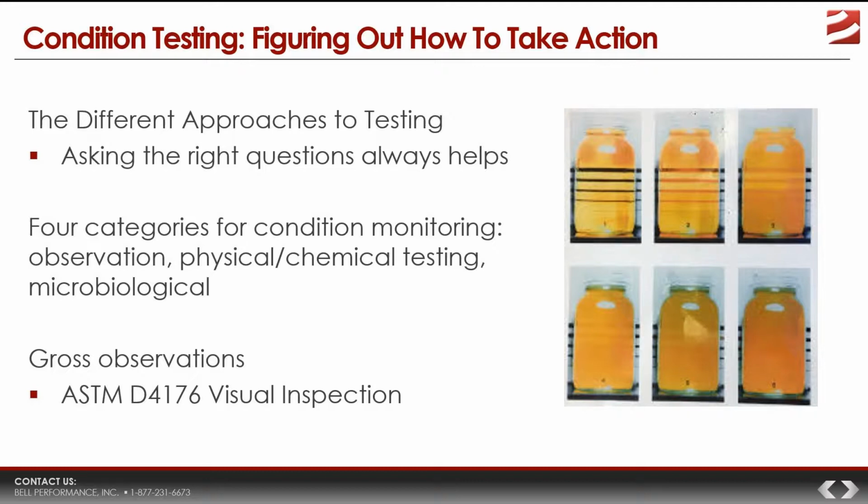Now, when you're visually inspecting fuel, we said look at the fuel to see if it looks different. When you're visually inspecting fuel, well, there is an ASTM protocol for that. It's D4176, visual inspection for water and particulates. And that's actually a 2-step process that can really help someone, I don't want to say streamline this, but do this in a rigorous manner. So the first step would be you look at it and you check for free water and particulates. Now that's provided that you don't already have a clearly visible water phase. Because if you do, that answers the question right there.